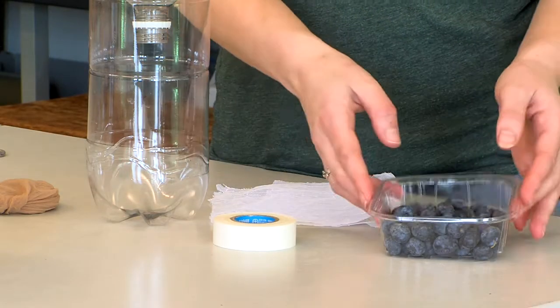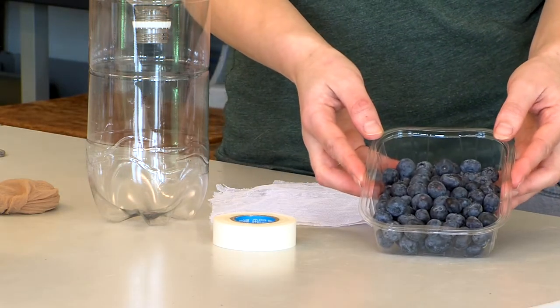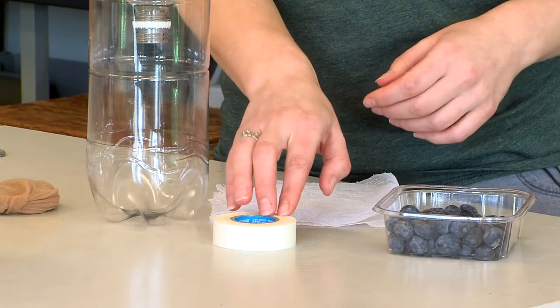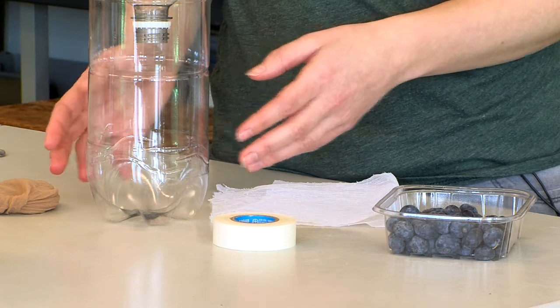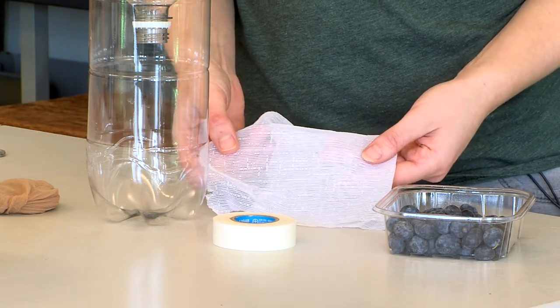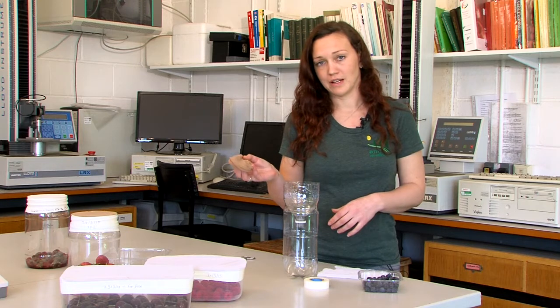To do the emergence test you will need a punnet of ripe fruit that has been randomly selected from a vulnerable area of crop, a roll of electrical tape, a clear container, and a fine mesh to cover the container with. The mesh needs to be 0.8 millimeters in size, as anything larger than this and the flies can escape. You can use any fine material such as offcuts from net curtains or even a pair of tights.